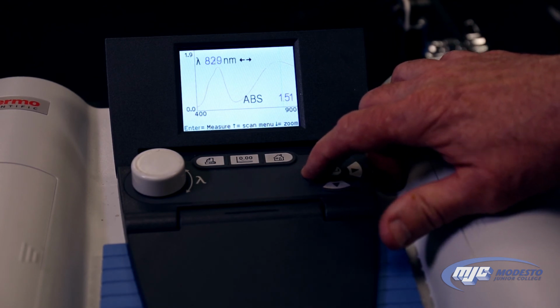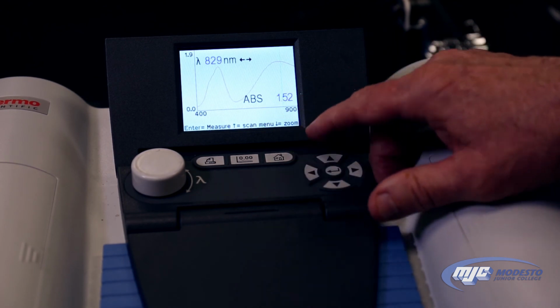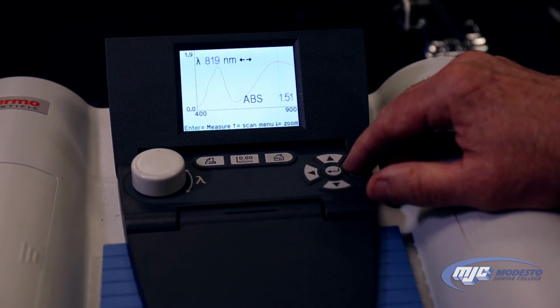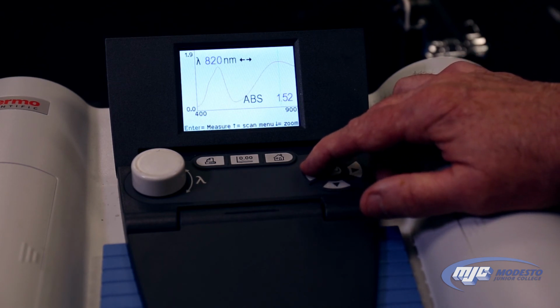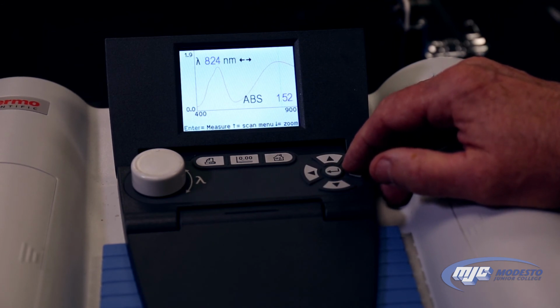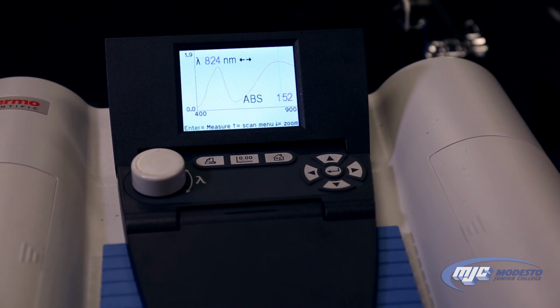So let's see, I see 1.52 at 829, again at 823, again at 820, so roughly 824 is in the middle somewhere. So why don't we call 824 our Lambda Max for the copper. I'm going to write that number down in our data table too. So 513 nanometers for cobalt, 824 for copper.